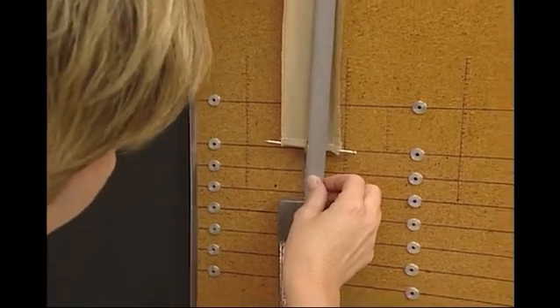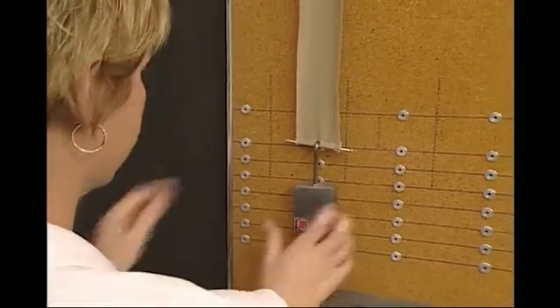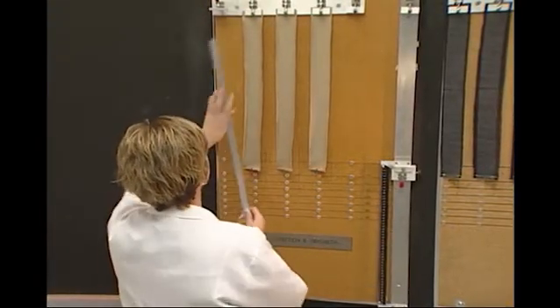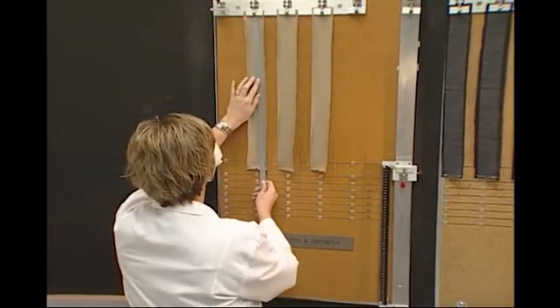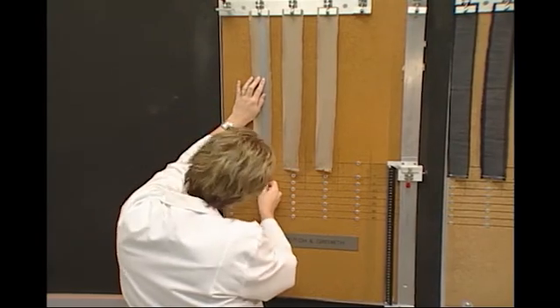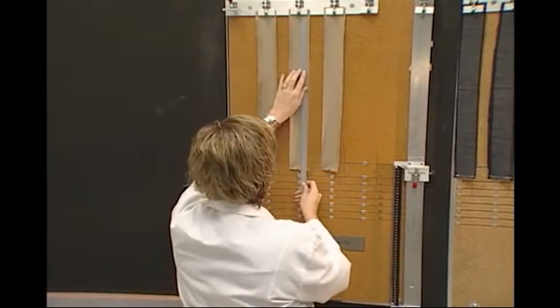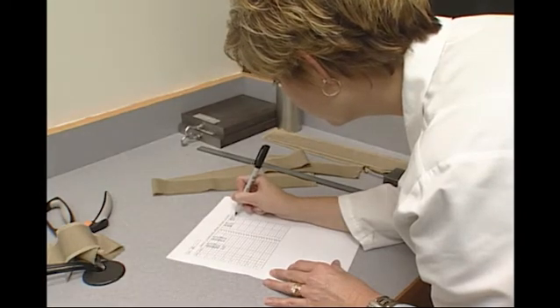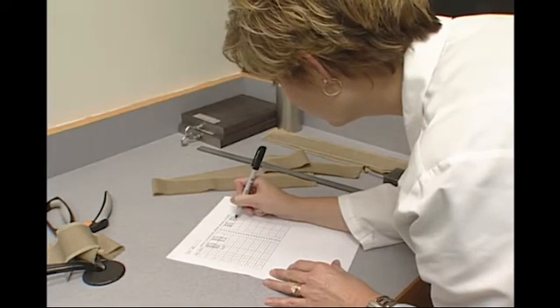Once the stretch with tension distances are recorded, the weight is removed from the specimen. The test calls for remeasuring the distance between the benchmarks after 30 seconds, 30 minutes, 1 hour, and after 2 hours. These measurements allow for the calculation of growth after stretching to a specified extension.